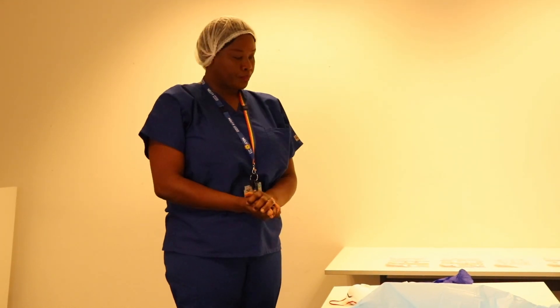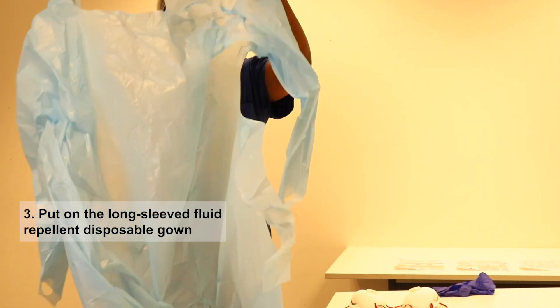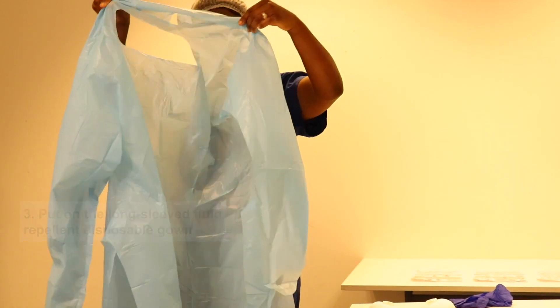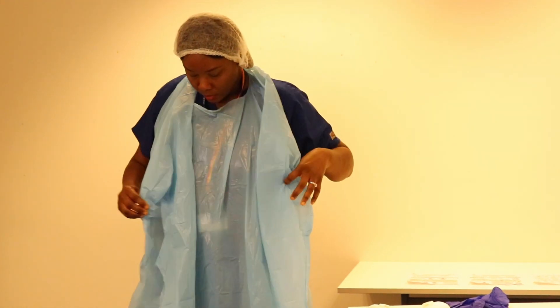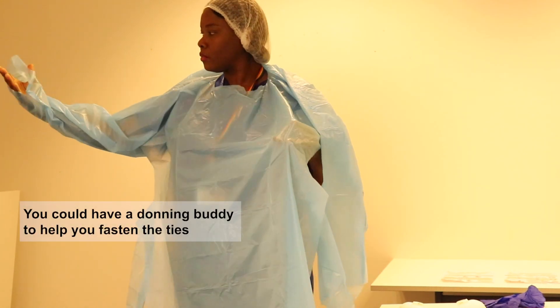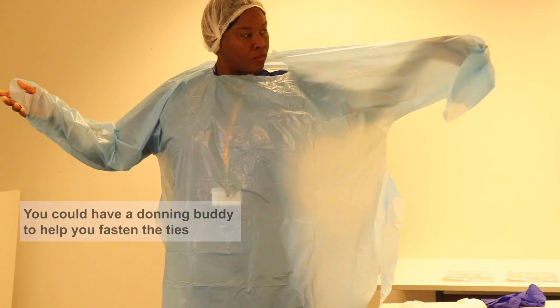Next you would put on your gown. Now there are several different types of gown but they're all roughly the same. This particular one you put over your head and it's got thumb holes for you to put your thumbs through. Someone can help you do this — you can have a donning buddy who can help tie it up at the back for you.